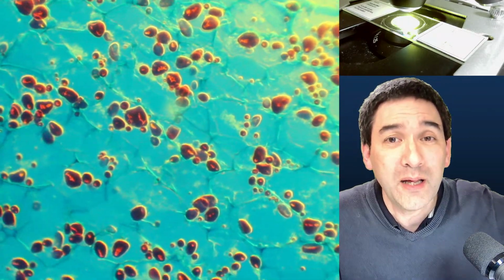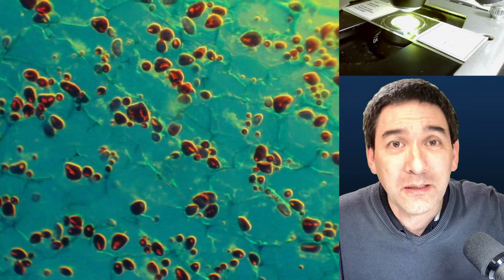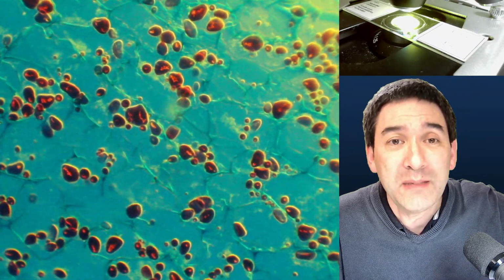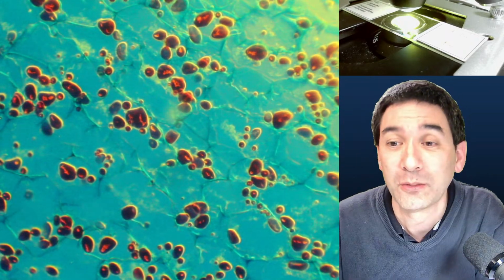And another reason why I'm using a DSLR camera is look, simply by turning a wheel, I'm able to immediately adjust the brightness of the image. So this is actually something for practical purposes here.